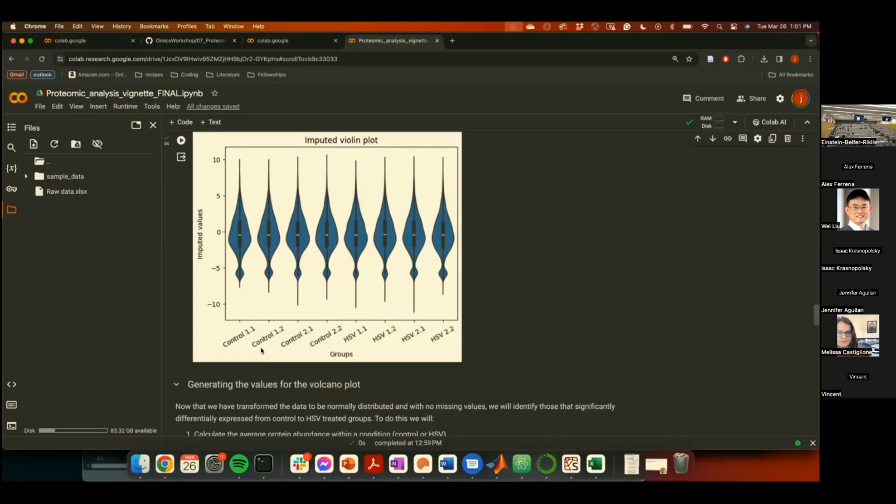So there, in Excel or in Python, we add this random number, right? And a random number, when you use the random formula, creates a value that is between 0 and 1. But because we are working with logarithms, between 0 and 1 is a very wide distribution, right? So you are basically imputing a value which has a very large variation, because it's a big chunk of the graph.